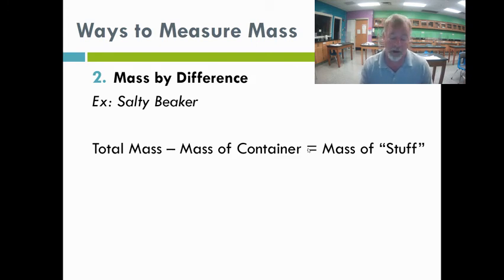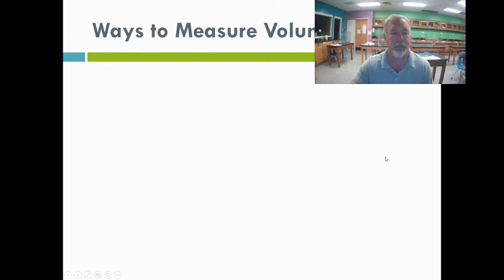These scales are nice. They have the 0 button. We won't need to do this very often, but there will be times we're going to need to use this kind of calculation. Just remember, we want to know what the container weighs before the reaction and after the reaction. The difference between those tells us the amount of stuff that we put into our container.